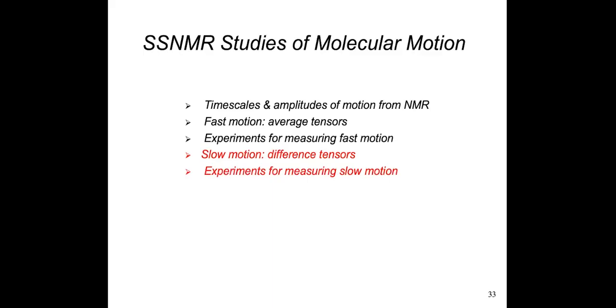Goldberg CP is a version of CP where the homonuclear proton-proton dipole coupling is removed by Lee-Goldberg radiation. So it's actually quite nice. If you're interested, at the end I can come back.